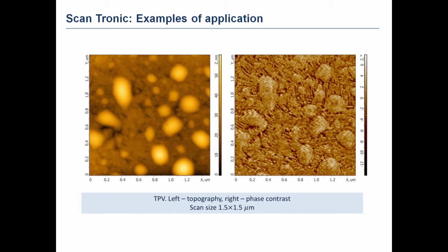As far as we can see, the general approaches and the algorithm that we have developed to automatically adjust the tapping mode parameters allow us to scan a variety of samples, and some examples have been given already.